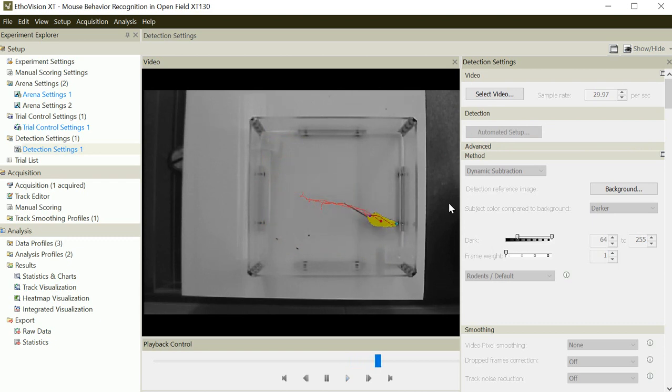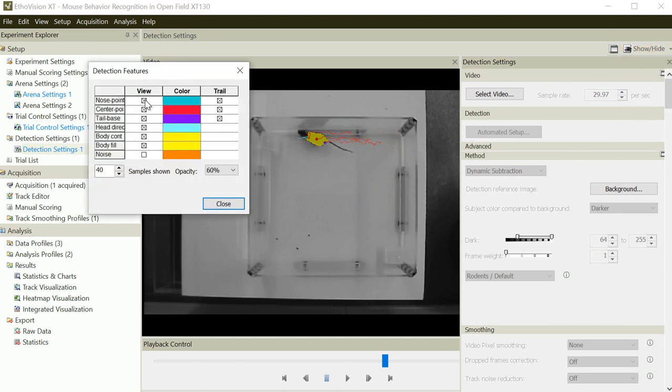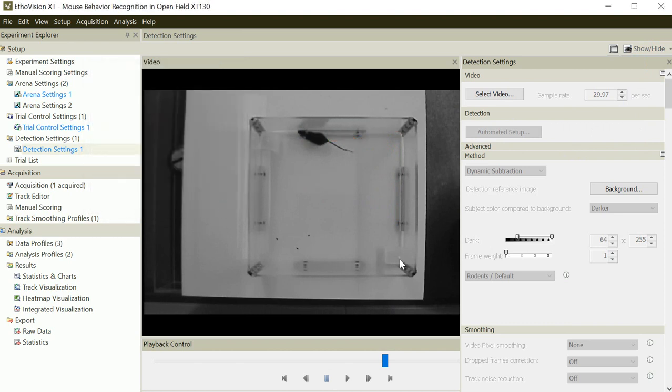But please be cautious. Please pay attention to the condition of the original video. This is a video you are going to make or you have already made, and you can understand very well that the contrast between the animal and background is quite clear.